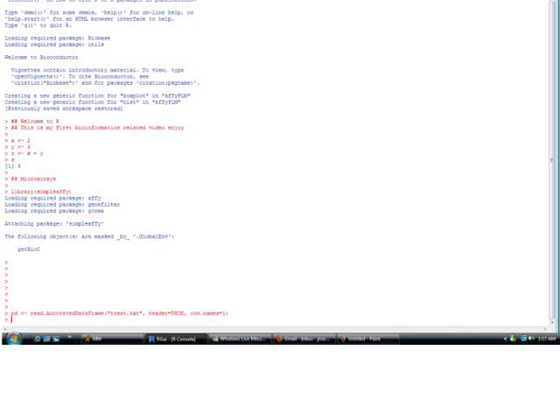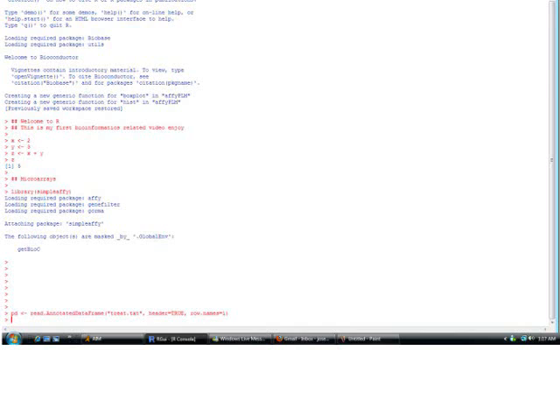We're going to use the SimpleAffy command read.AnnotatedDataFrame, treat.txt, header equals true, and row.names equals one.